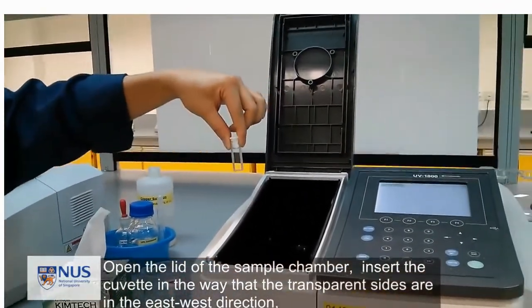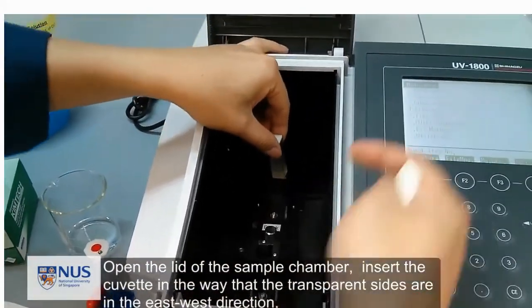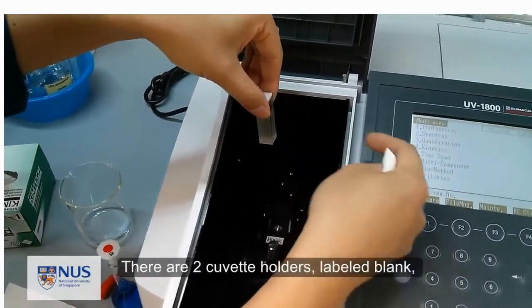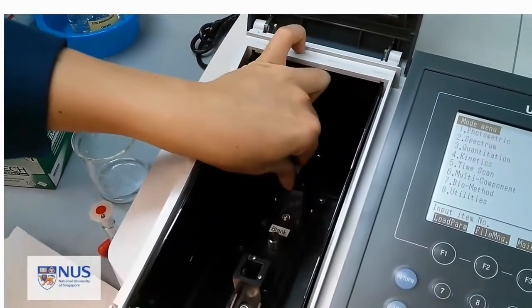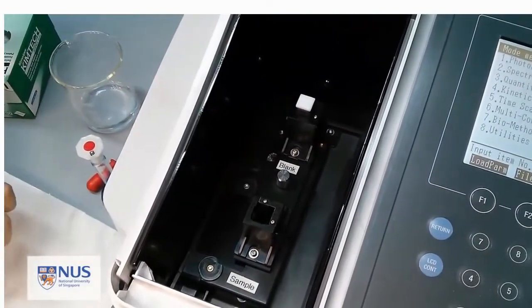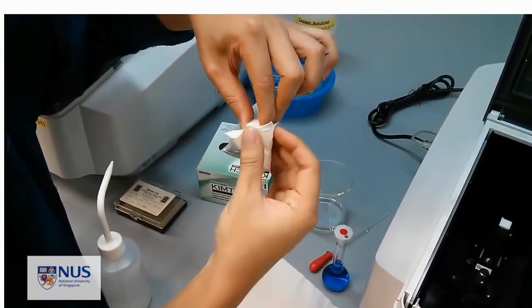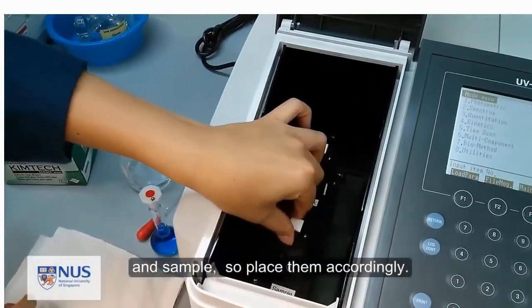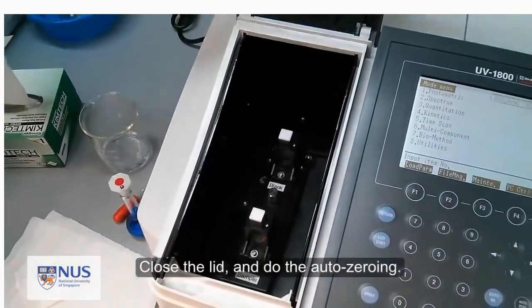Open the lid of the sample chamber. Insert the cuvette in the way that the transparent sides are in the east-west direction. That's where the light is coming from. There are 2 cuvette holders labeled blank and sample, so place them accordingly. Close the lid and do the auto zeroing.